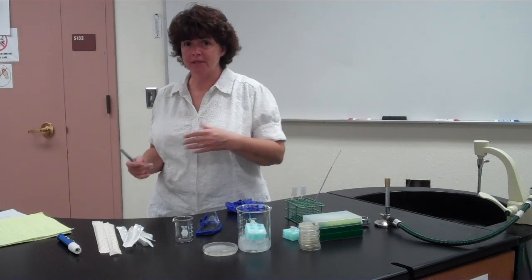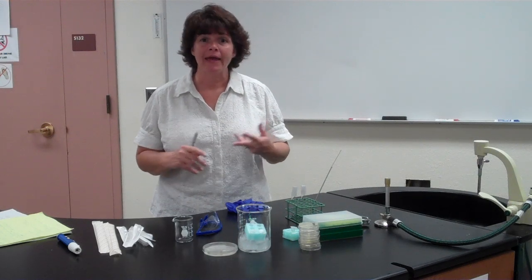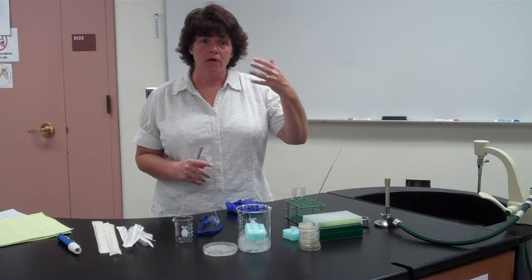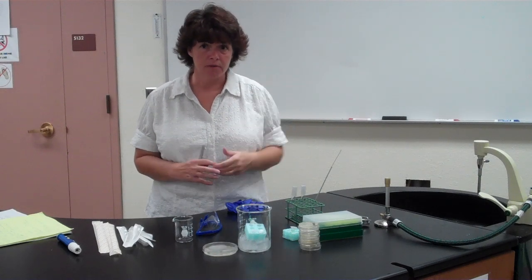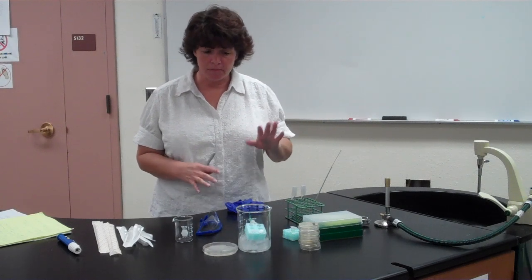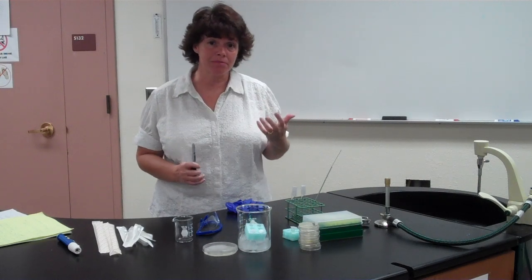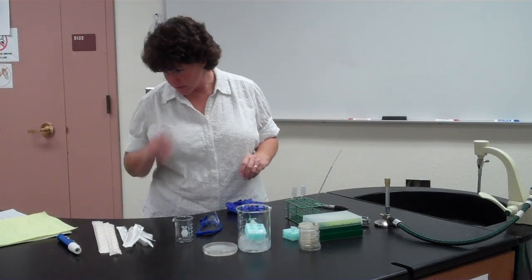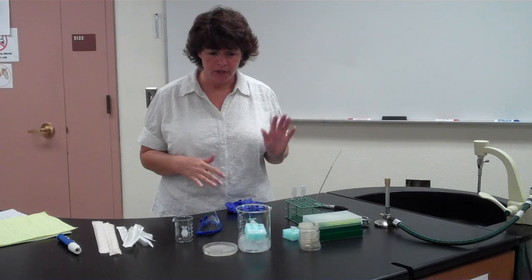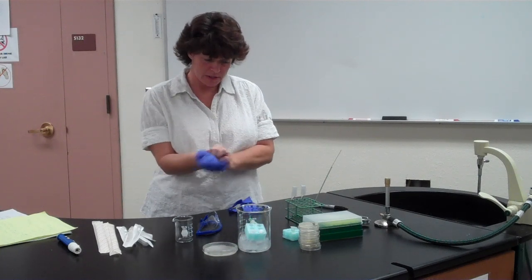This is a plasmid that is manufactured to have the ampicillin resistance gene and the LAC-Z gene, but also has some different sites that you can put a restriction enzyme cut in, okay? But since we're not adding that gene, that's not quite as important, but definitely look at the book at what that plasmid looks like, okay? So then with these two particular tubes, we're going to aliquot 250 microliters of our particular solution into these tubes.